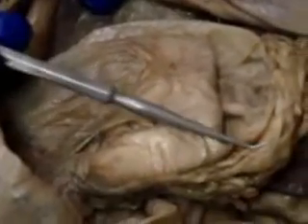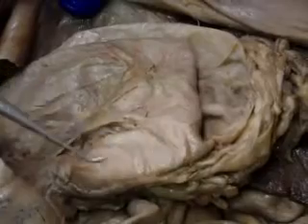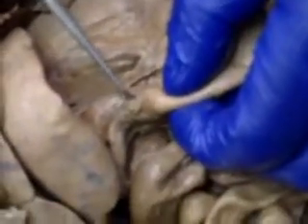The majority of the stomach here is the body of the stomach. After this turn right here, you see it right there, that is the pyloric region of the stomach. And so at the end of the pyloric is this little indentation right there, and that's where the pyloric sphincter would be.